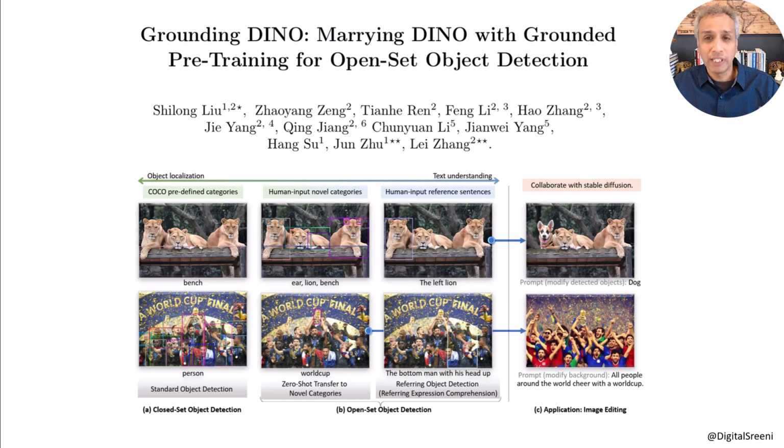At the end of the day, for our microscopy use case, the important intuition is that Grounding DINO is not really segmenting anything. It's doing text-guided object localization, which is nothing but bounding boxes. That's it. Okay? The model was primarily trained on natural images, COCO, Objects365, and similar datasets. It's excellent on natural photographs, amazing on natural photographs. And in fact, I was a bit surprised that it even worked on scientific images, which is why I'm doing this tutorial.